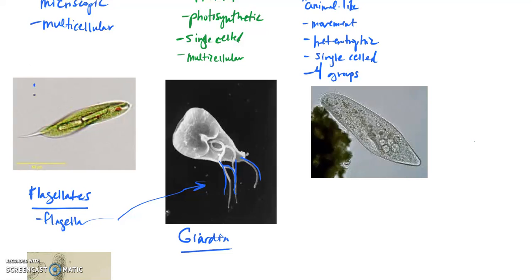Okay, this guy up here should also look familiar to you because you looked at Euglena as part of your lab. Now I want to make sure you see, here's the flagellum right here, okay, for this particular organism. Now Euglena is really interesting because it has a flagellum, but it also has chloroplasts. So notice it's green because of the chloroplasts. So it's able to self-feed, or make its own food, and it really can switch. It also can be heterotrophic. So depending on the conditions, Euglena can really switch between making its food if there's plenty of abundant sunlight, and if not, consuming food by being a heterotroph.